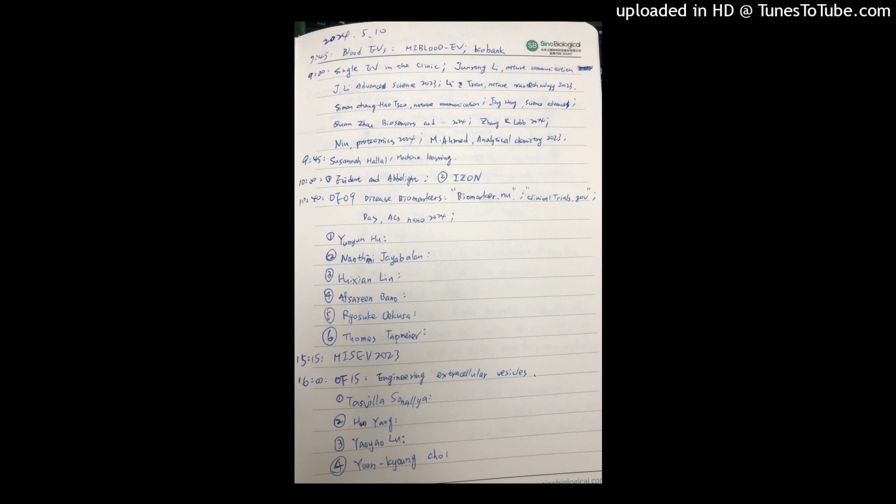It was really interesting that we found a distinct profile of microRNA that was only enriched in the EVs, and some of the microRNAs were highly expressed in the GDM adipose tissue EVs. So based on bioinformatic tools and literature search, we narrowed our microRNA candidates to 3 of them and performed qPCR validation. We found our 3 microRNA candidates were highly expressed in the EVs compared to the adipose tissue or placenta, and even more highly expressed in the GDM EVs.